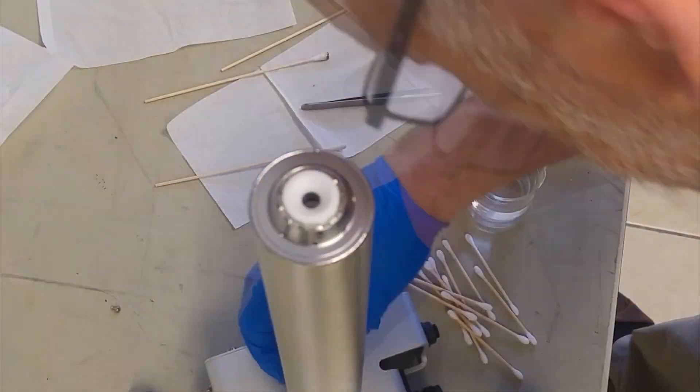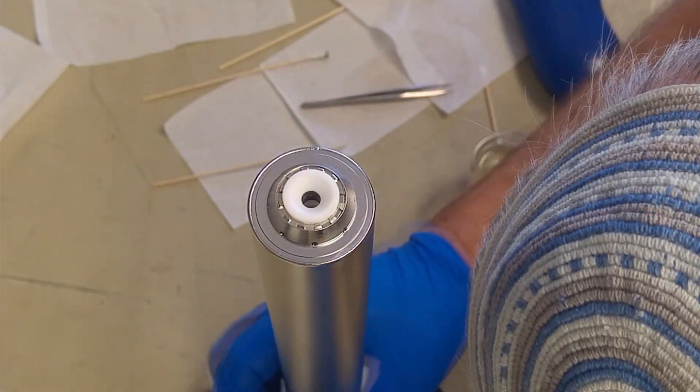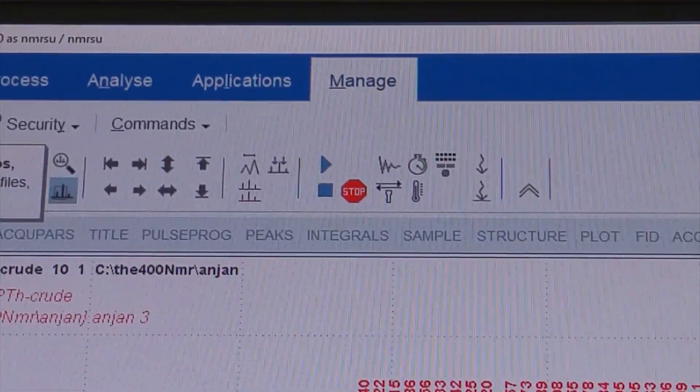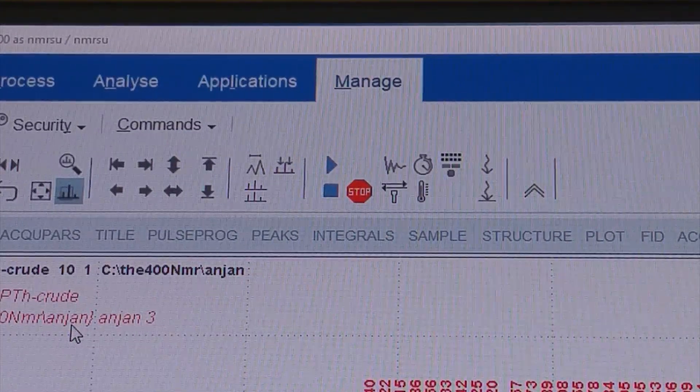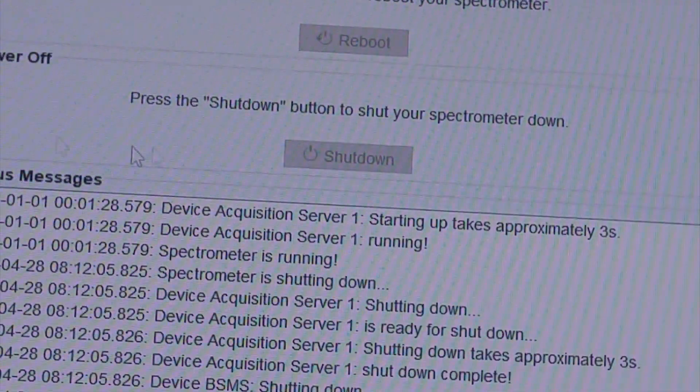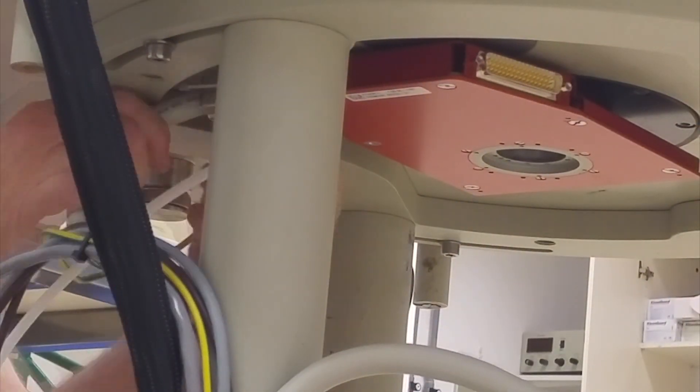The tubes are then returned to the probe head and the ceramic cap placed on top, not forgetting all its three springs. Finally, the can is replaced, orienting it so that the allen screws can be tightened. Before removing the bore, the spectrometer console must be shut down. Disconnecting the shim coils while they are on will burn out the circuitry. Unscrew and disconnect the shim connectors under the magnet.